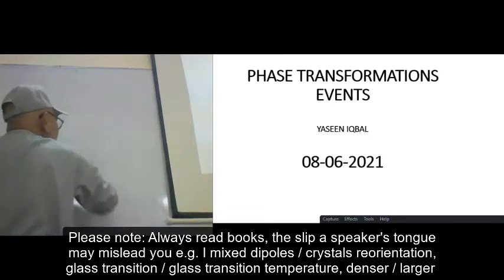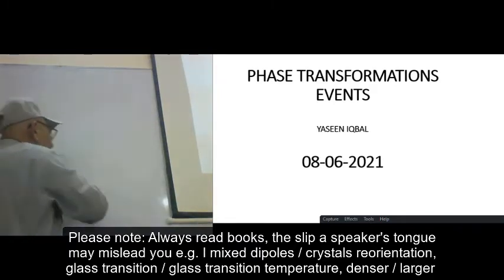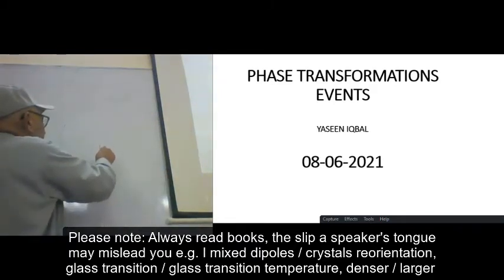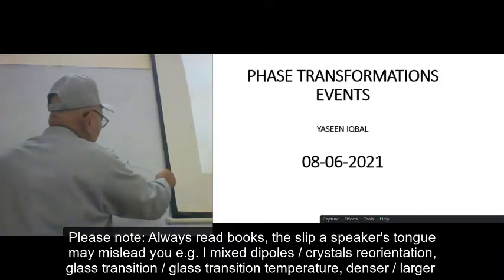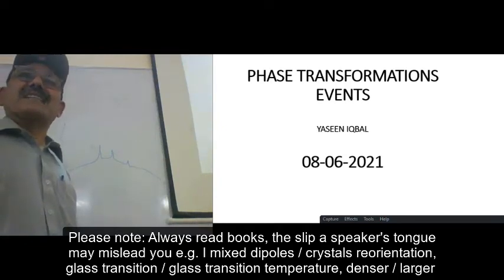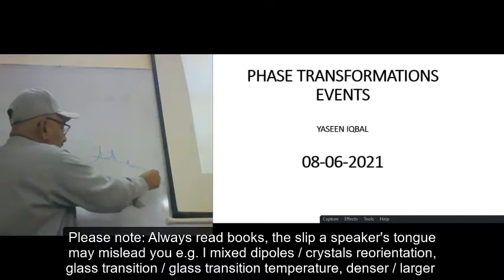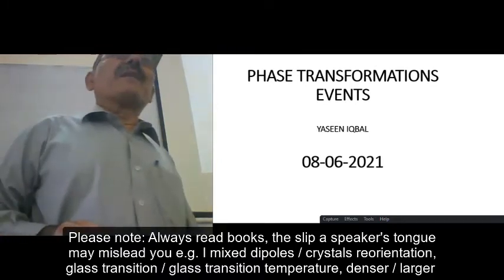With the scientist's eye, you can easily know that if you crystallize the material and it gives you an X-ray diffraction pattern like this, this means this portion is the crystalline phase and this whole area is the amorphous phase.